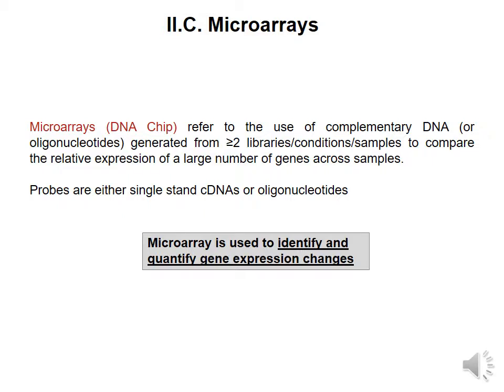And that's a big difference compared to qRT-PCR that we described in video number 2, in which you can only determine a small number of genes. In this case, we're talking about hundreds of genes that can be analyzed simultaneously.